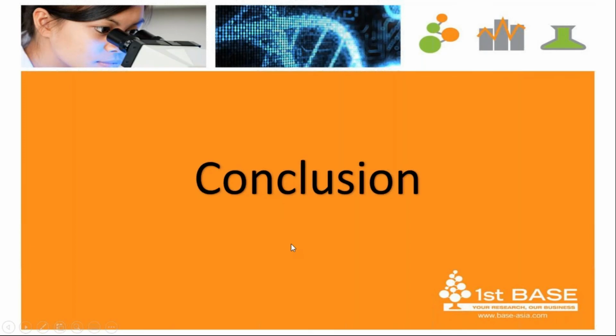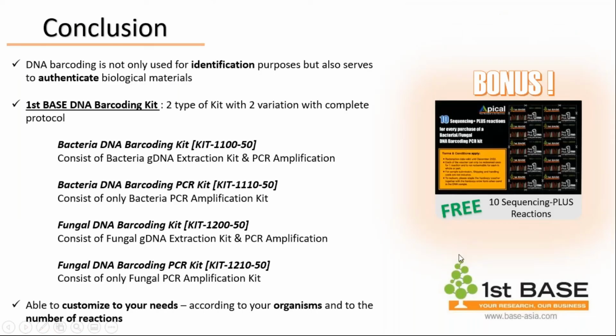Let's come to a conclusion. DNA barcoding is not only used for identification purposes, but also serves to authenticate biological materials. In this First Base DNA barcoding kit series, we kickstart with two genes, bacteria and fungal barcoding.